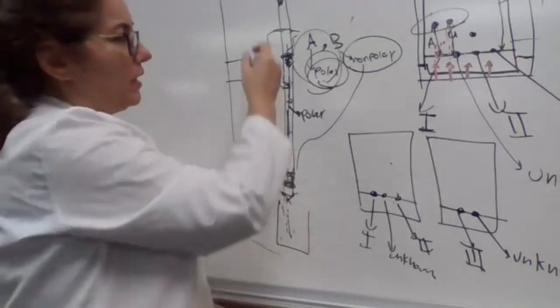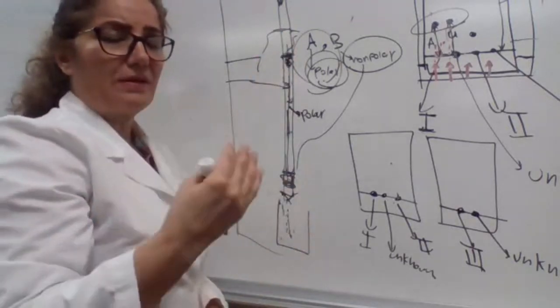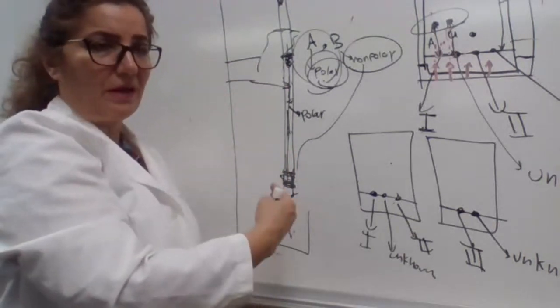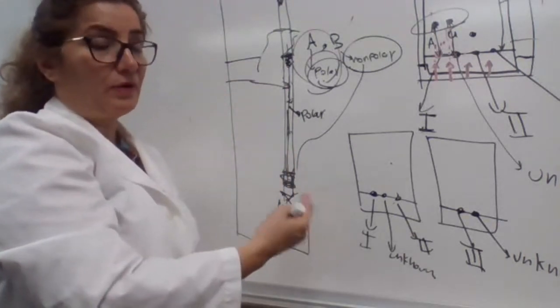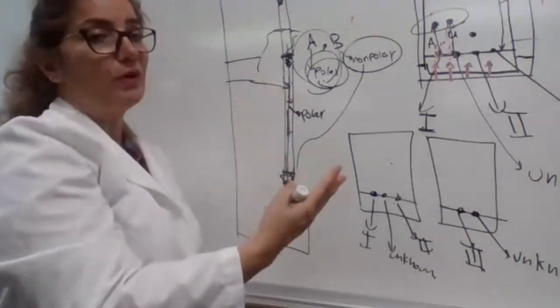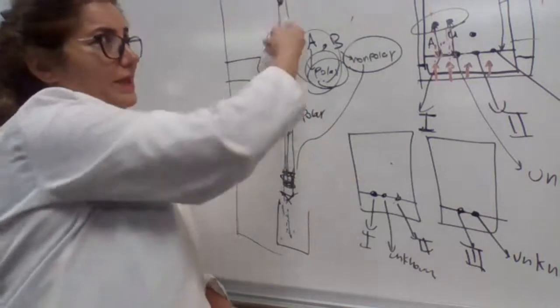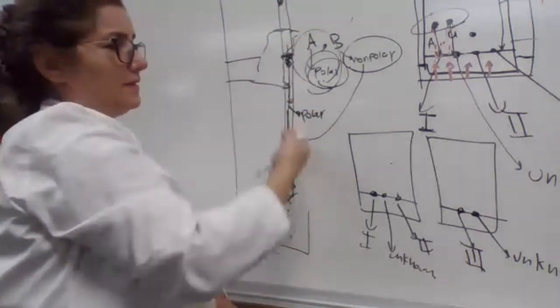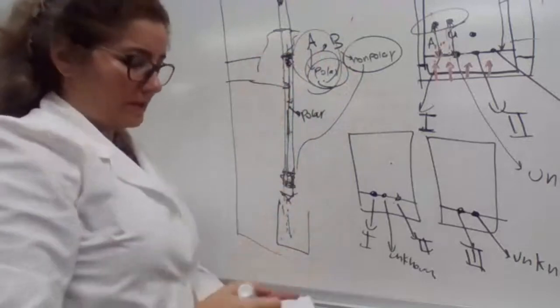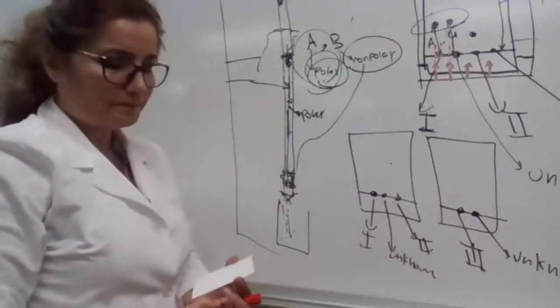That's why in column chromatography we use 3 different solvents for elution. The eluting solvent is first non-polar or less polar, and then we go to more polar and most polar solvent to make sure that the polar sample is also eluted.